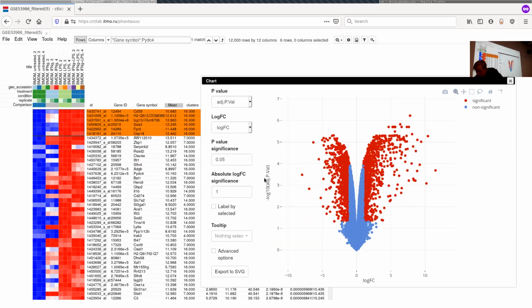So there is an important difference in statistics: you have p-values that represent statistical significance, and also effect size, which represents some kind of physical difference. And usually they are somehow correlated.